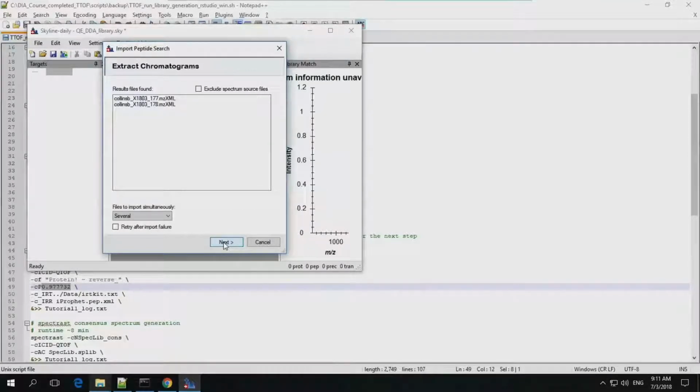similar, although if you go read the IRT paper, we did change the gradient length. We went from a 30-minute gradient to a 90-minute gradient, and you can read about how that went. It worked fine. You can merge the IRT libraries afterwards if you build them separately, I guess. You definitely can, but you shouldn't do it for different chromatographic methods.